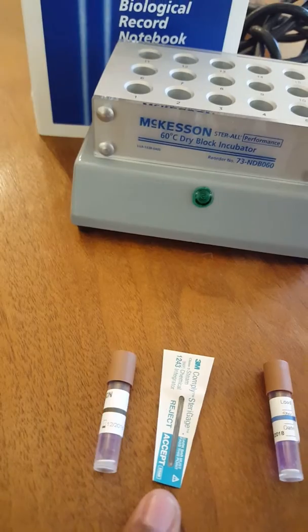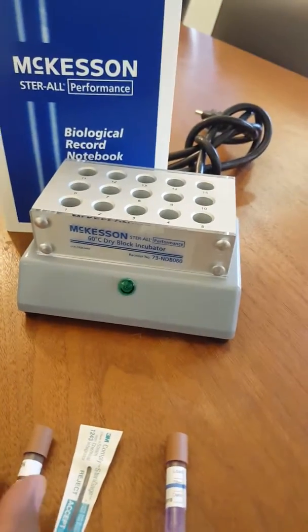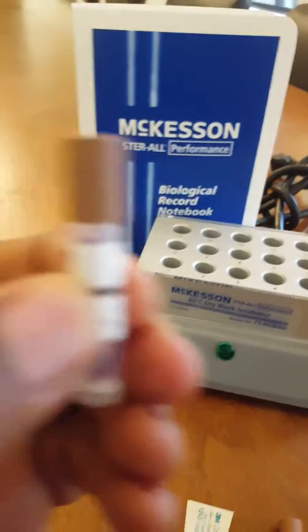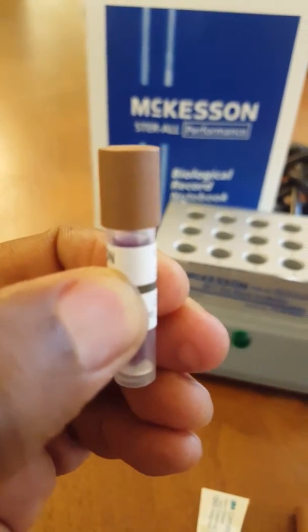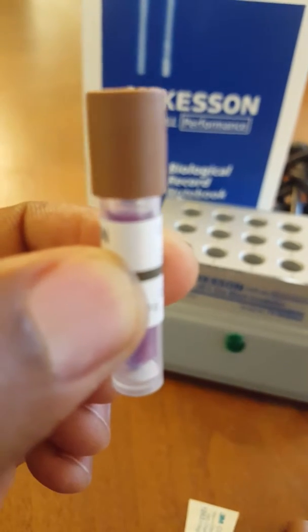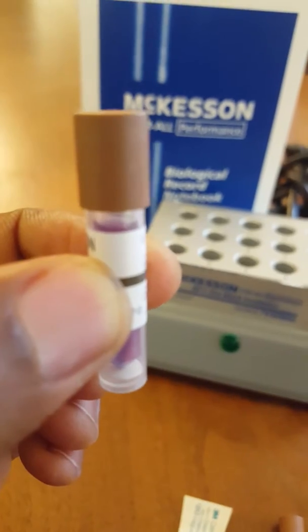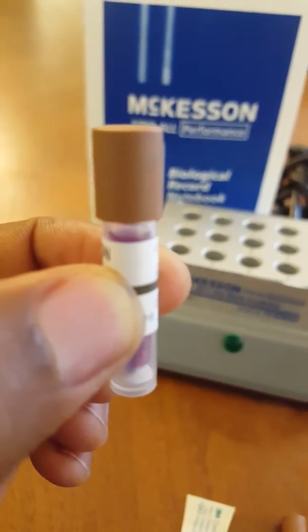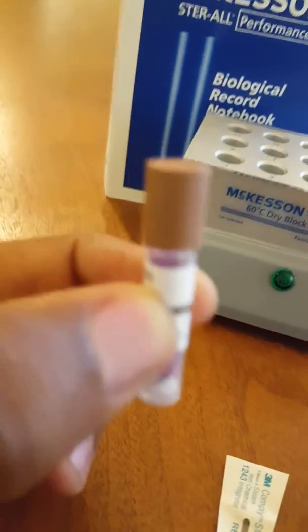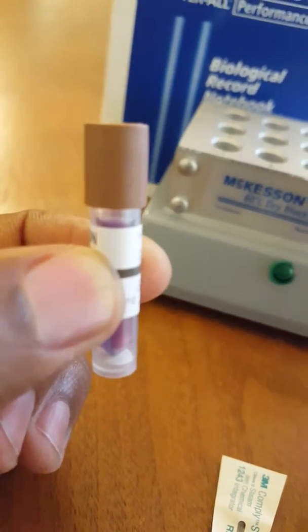temperature as well. The next part that we're going to do is take the BI indicator and crush the ampule. I'm not going to crush it now. And what you'll notice, there's a little pad that's underneath there. That little pad is preloaded with spores. And anytime that you put it in the autoclave, what it's supposed to do is kill any presence of spores within that little pad.